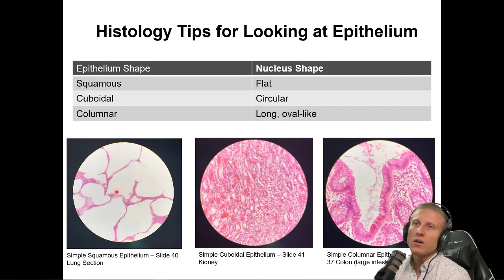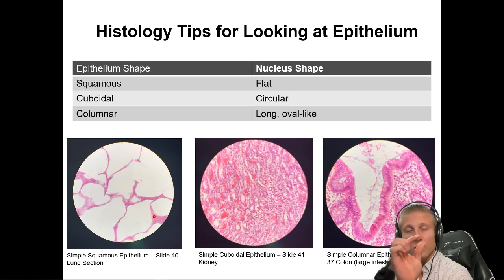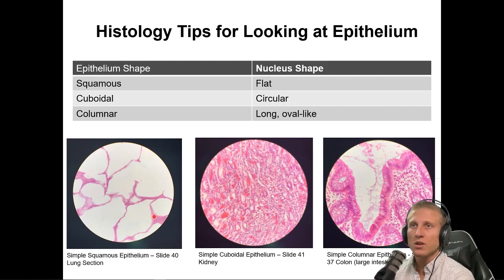This is the alveoli of the lung, which are single cell layers thick, simple squamous epithelium. This is very beneficial for the process of diffusion, right? We're trying to exchange gases across a membrane. Well, the thinner that membrane is, the faster that exchange can occur.